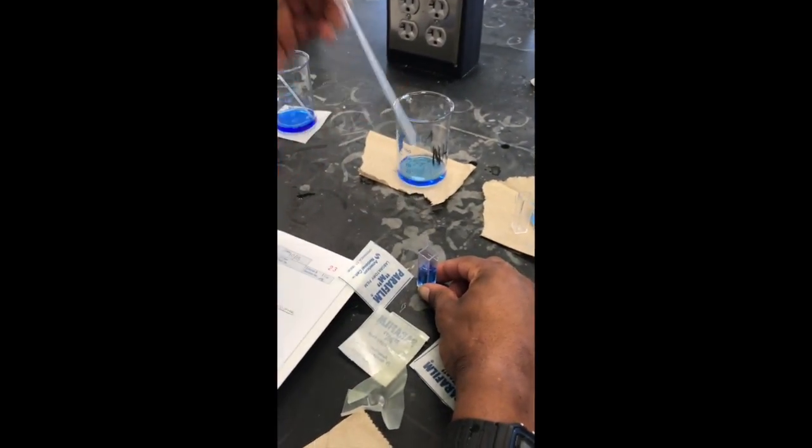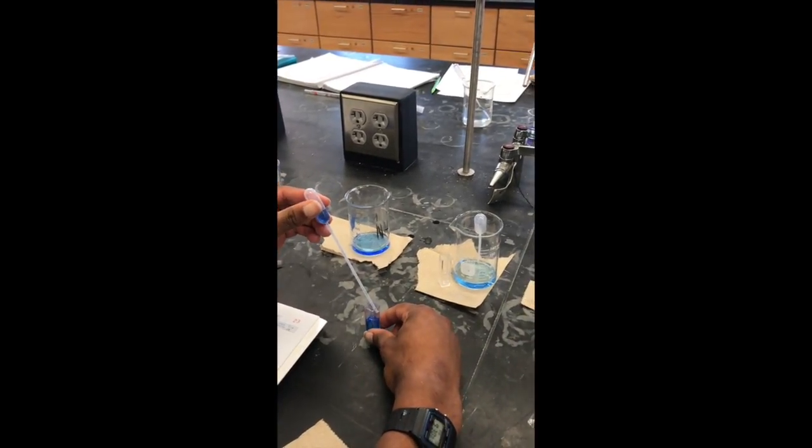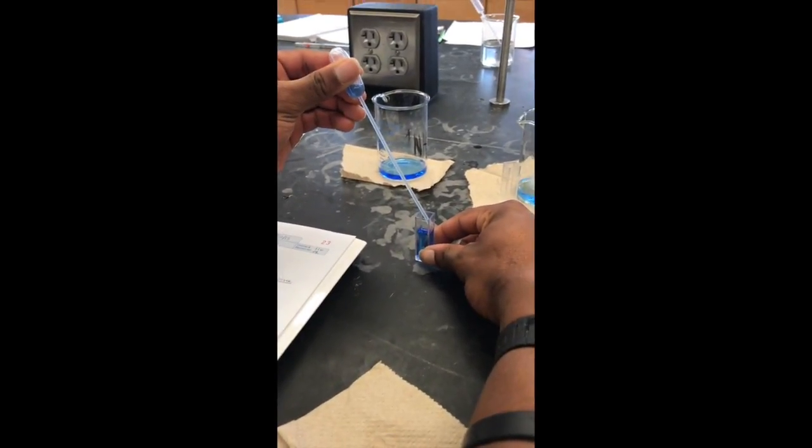For each of the dilutions, transfer sufficient, but not excess, solution to the cuvette. Fill the cuvette up to the line using a transfer pipette.